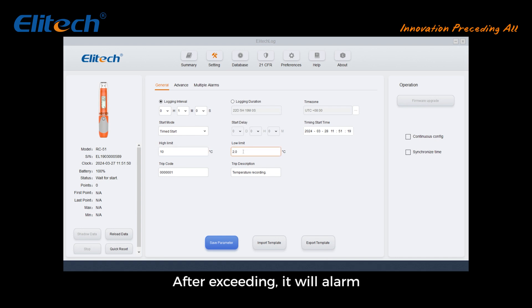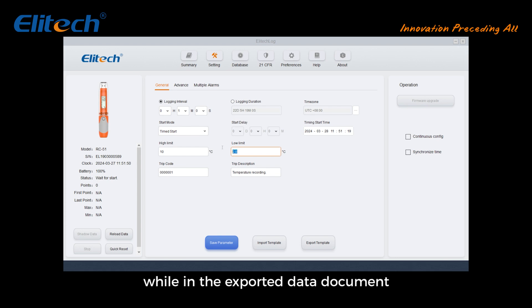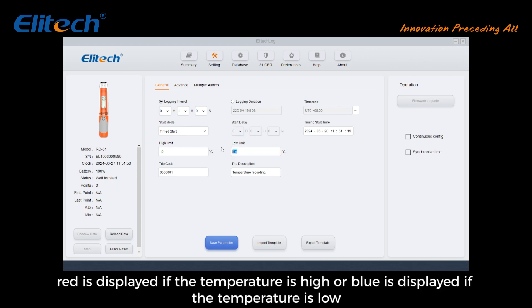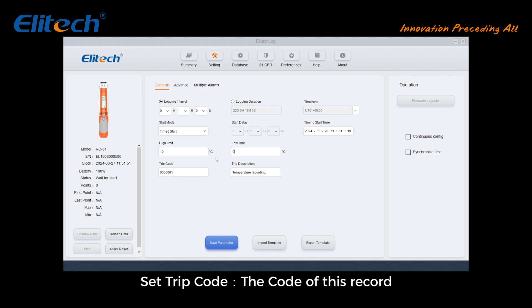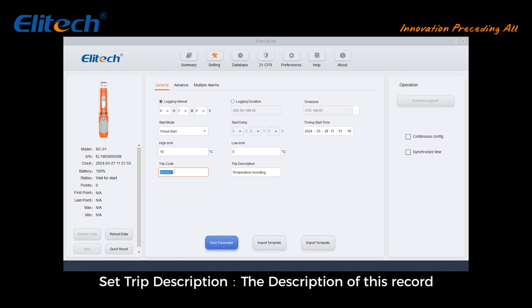Set high and low temperature limits — after exceeding these limits, an alarm will trigger. In the exported data document, red is displayed if the temperature is high and blue is displayed if the temperature is low. Set the trip code, which is the code for this record, and set the trip description, which is the description of this record.